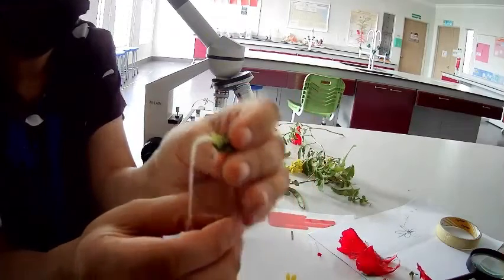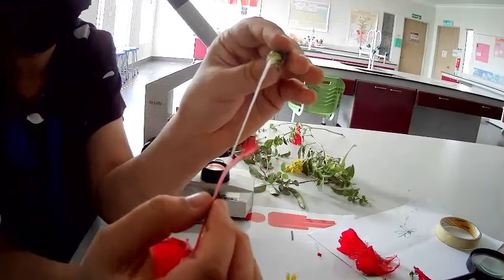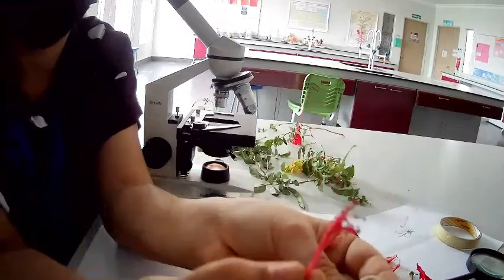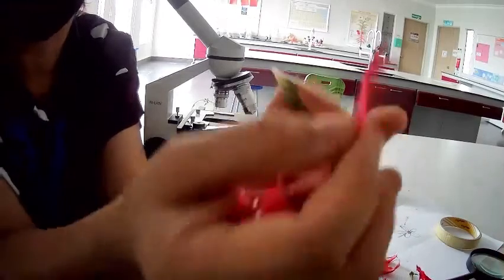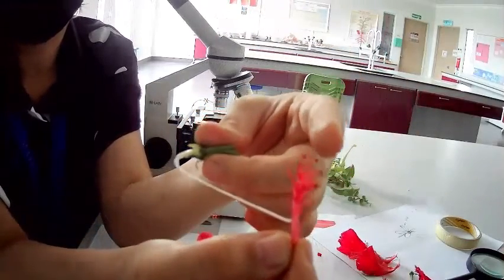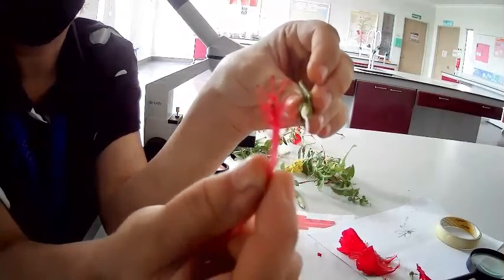This is the ovary, and this is the style of the female. I continue because the style is quite hard, so it cannot be broken easily. I just pull it off. These are what you see here on the shape. These are the yellow parts that are pollens on the male part, which is anther, and the anther is surrounding the female. So those rounded shaped things that I will show you under the microscope, they are the female part, the stigma of the female.